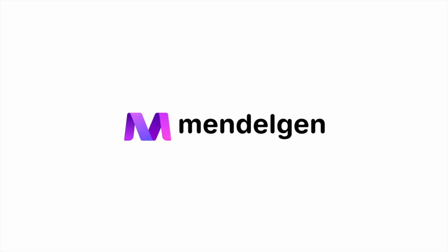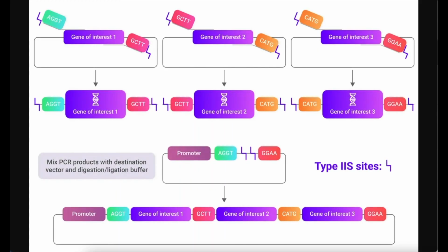In this video, we will show you how to simulate Golden Gate cloning on Mendelgen. Golden Gate cloning is a restriction cloning technique that takes advantage of type 2S restriction enzymes. Type 2S restriction enzymes cleave outside their recognition sites, leaving fragments with flanking overhangs.